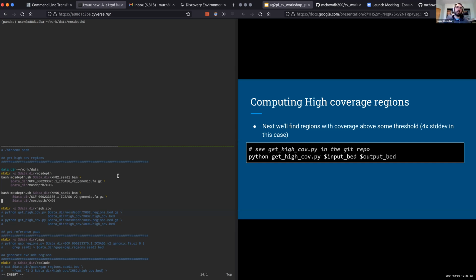All right. So going back to the commands list shell file in our Cloud Shell, I'm just going to recomment some of the code that we've already written since we don't want to rerun it. In the Vim text editor, if you want to start inserting characters, you have to press the I key. That puts you into insert mode. Now I can type in individual characters and still navigate with the arrow keys. If I want to exit insert mode, I press the escape key, and that brings me back to the regular movement mode.